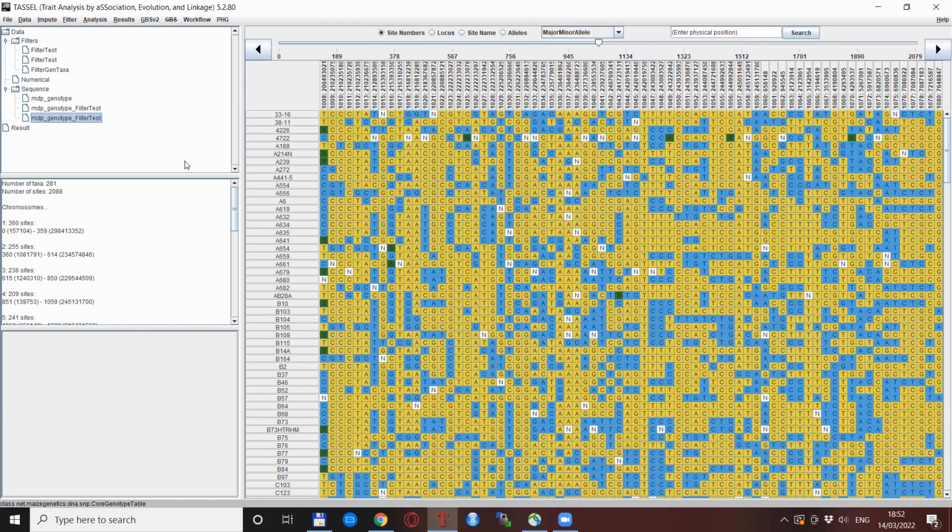So this was it for today for the basic filtering and quality control processes in TASSEL. There are a number of other options, as you've seen, which we might explore also in further parts of Genomics Bootcamp. But I encourage you to go forward yourself, perhaps with this tutorial data, click around and see what happens if you include or exclude some of the options, or change some of the options or include some lists, which of course will also be useful for your further work if you go on and work on your own data for your own research.